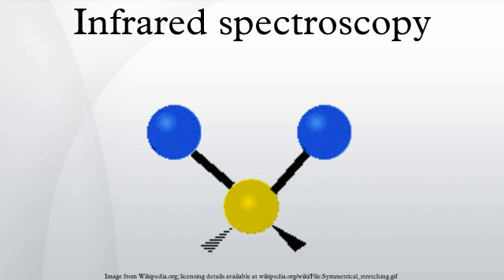Theory. Infrared spectroscopy exploits the fact that molecules absorb specific frequencies that are characteristic of their structure. These absorptions are resonant frequencies, that is, the frequency of the absorbed radiation matches the transition energy of the bond or group that vibrates. The energies are determined by the shape of the molecular potential energy surfaces, the masses of the atoms, and the associated vibronic coupling.